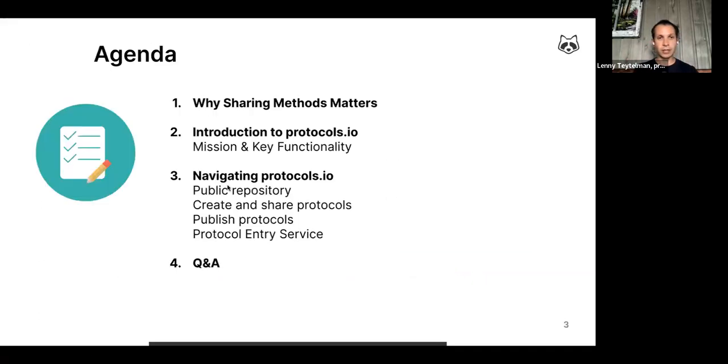So that's the housekeeping. And on this webinar, as I said, this will be introductory. We're going to talk a little bit about the motivation behind creating protocols.io, why it exists. And then I'll switch out of slides and go over some of the key functionality in a live demo of protocols.io, and we'll touch on all of these things in terms of navigating the platform, and then come to the Q&A. All right. And so without further ado, let's jump in.